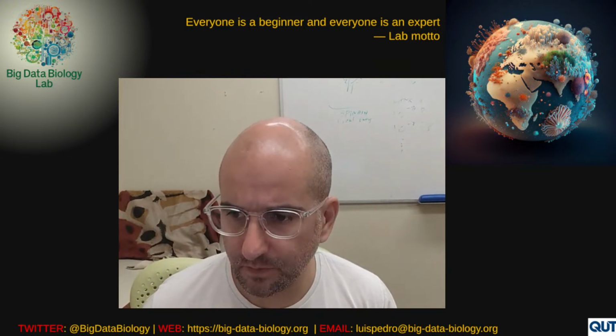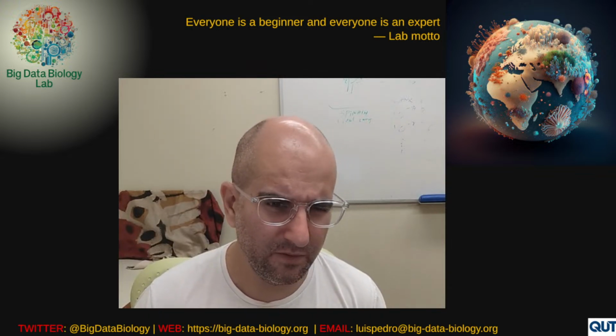So today we'll be picking up where we left off last week, which is looking at whether we can replace the KO annotations of genes that we had gotten from basically reusing the CheckM2 results with eggnog mapper. So using the CheckM2 results would have been great from a practical point of view, but as I said about 7 times in a row during the recap, better is better. So if there is something that's better, even if it's a little bit less convenient, a little bit more work, better is better. So let's see if we can get that to work.